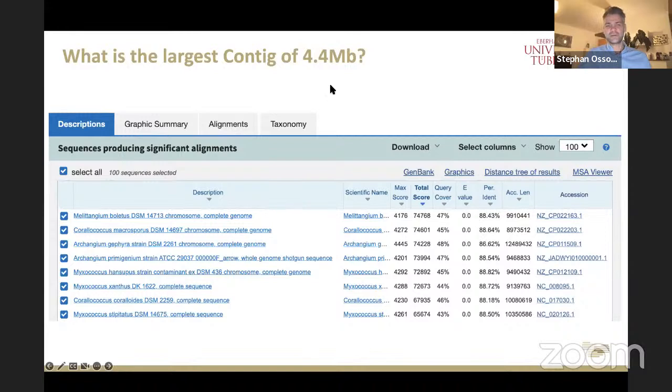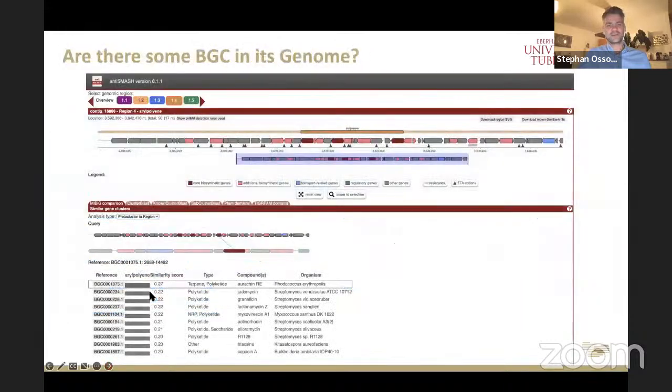So it's a bacterium which has no published complete genome in NCBI. If we look at antiSMASH, the 4th cluster here immediately jumped to my eye. It looks quite interesting. It has a lot of core biosynthetic genes and several additional biosynthetic genes in a nice cluster. All this stuff might, if you come from the field, be known to you.